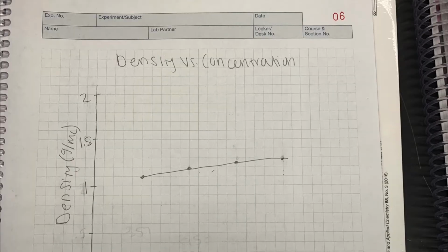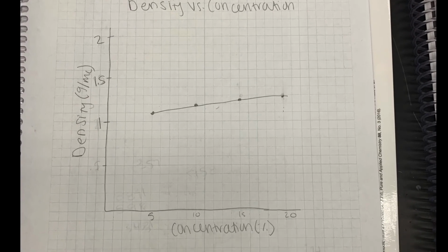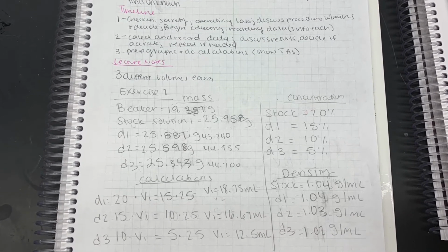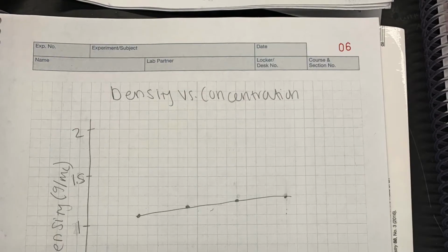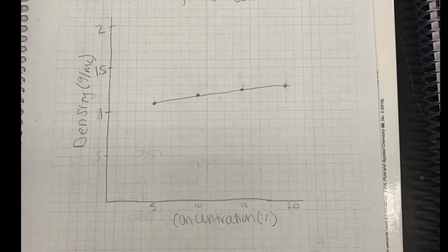Our graph is shown below. The ideal look of the graph is flexible. It just depends on your group and what numbers you chose to use. For us, our graph has more of a curve because we used larger numbers, but the only thing required is that your graph satisfies the linear aspect of density always increasing or decreasing as concentration increases or decreases.